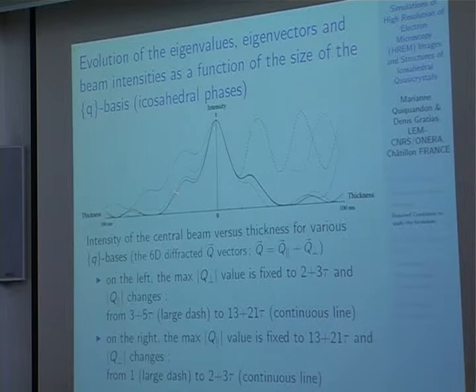We can notice two things. The first thing is that the Q basis is chosen with a large parallel bound, and the perpendicular bound is smaller. This is consistent with the experimental diffraction pattern, where the peaks with large perpendicular components have too weak intensity to be observed, and therefore the observed peaks on the experimental diffraction pattern form a discrete set. That's why we can apply this formalism.